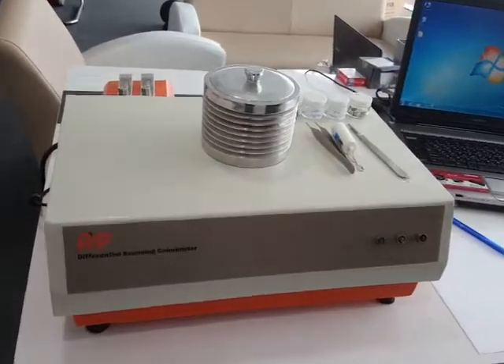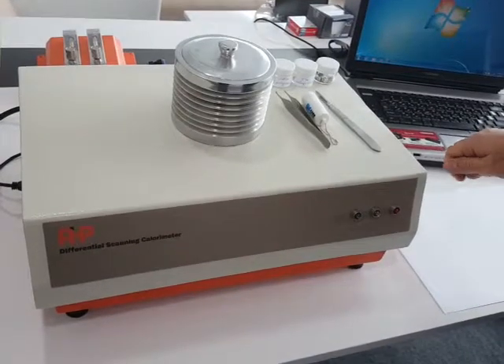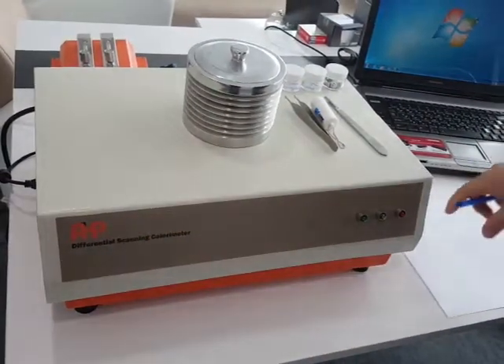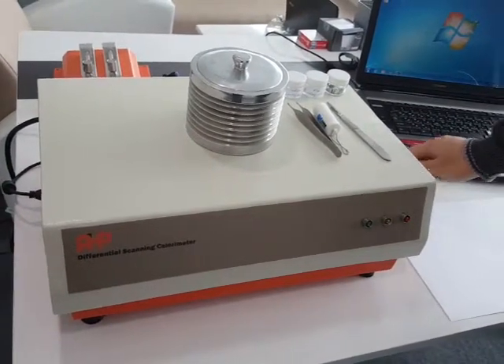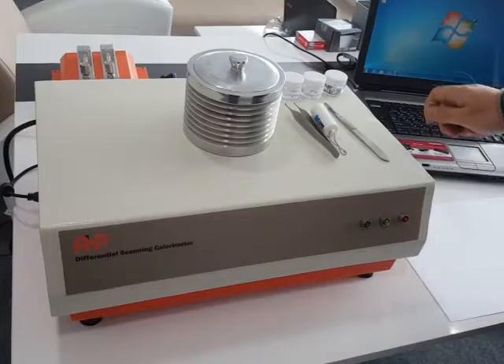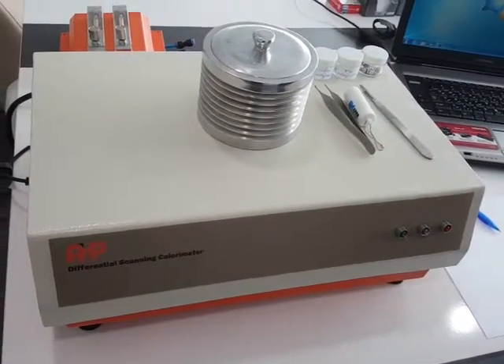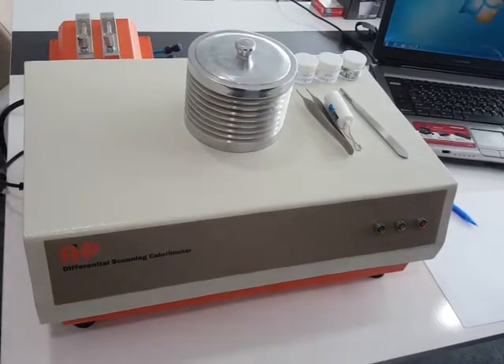I'm going to prepare a brief description about the AHP DSC machine. It's a differential scanning calorimeter used to define some specifications of raw materials — plastics raw materials — such as melting point, oxidation induction time, crystallinity, and temperature.